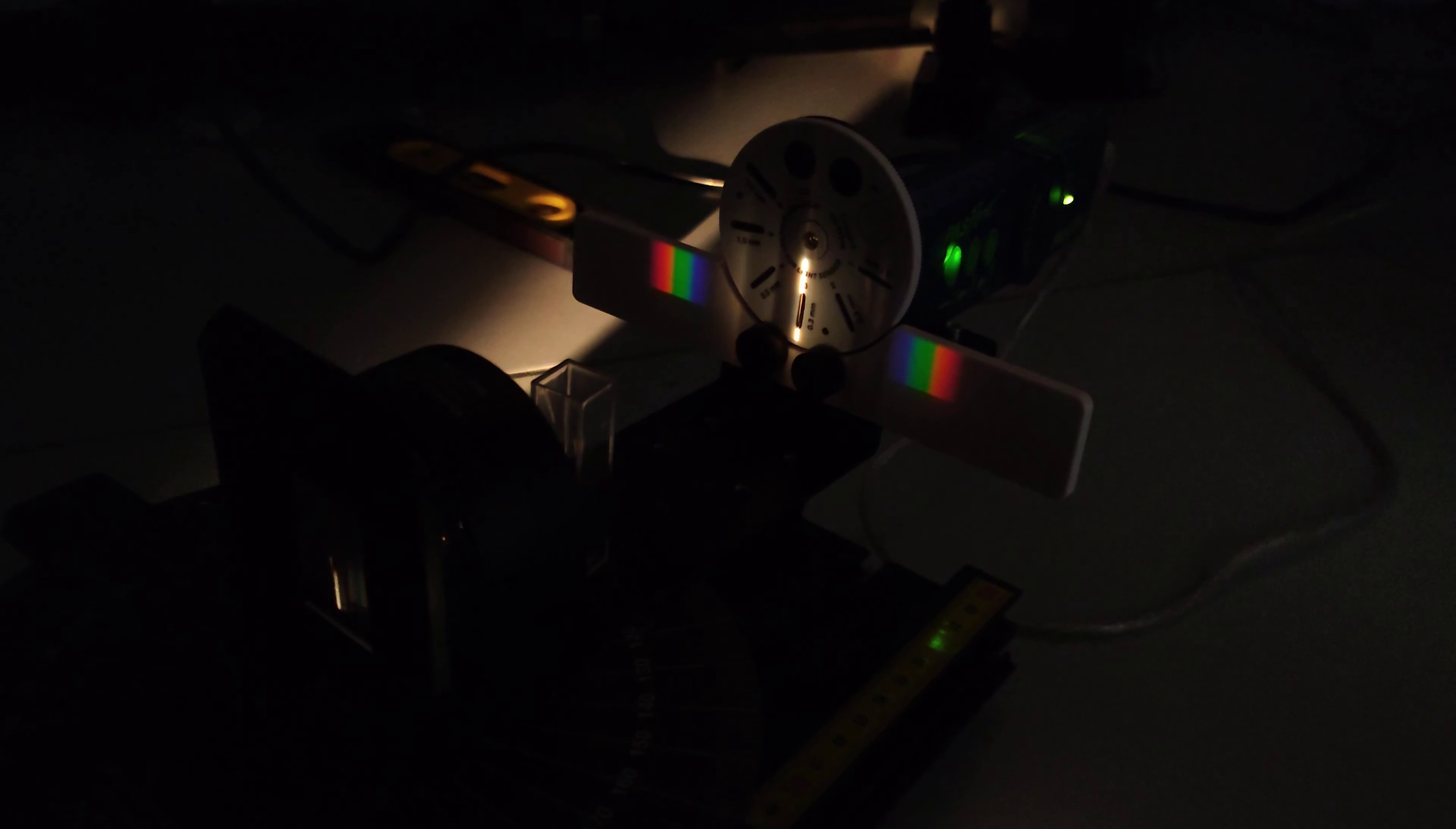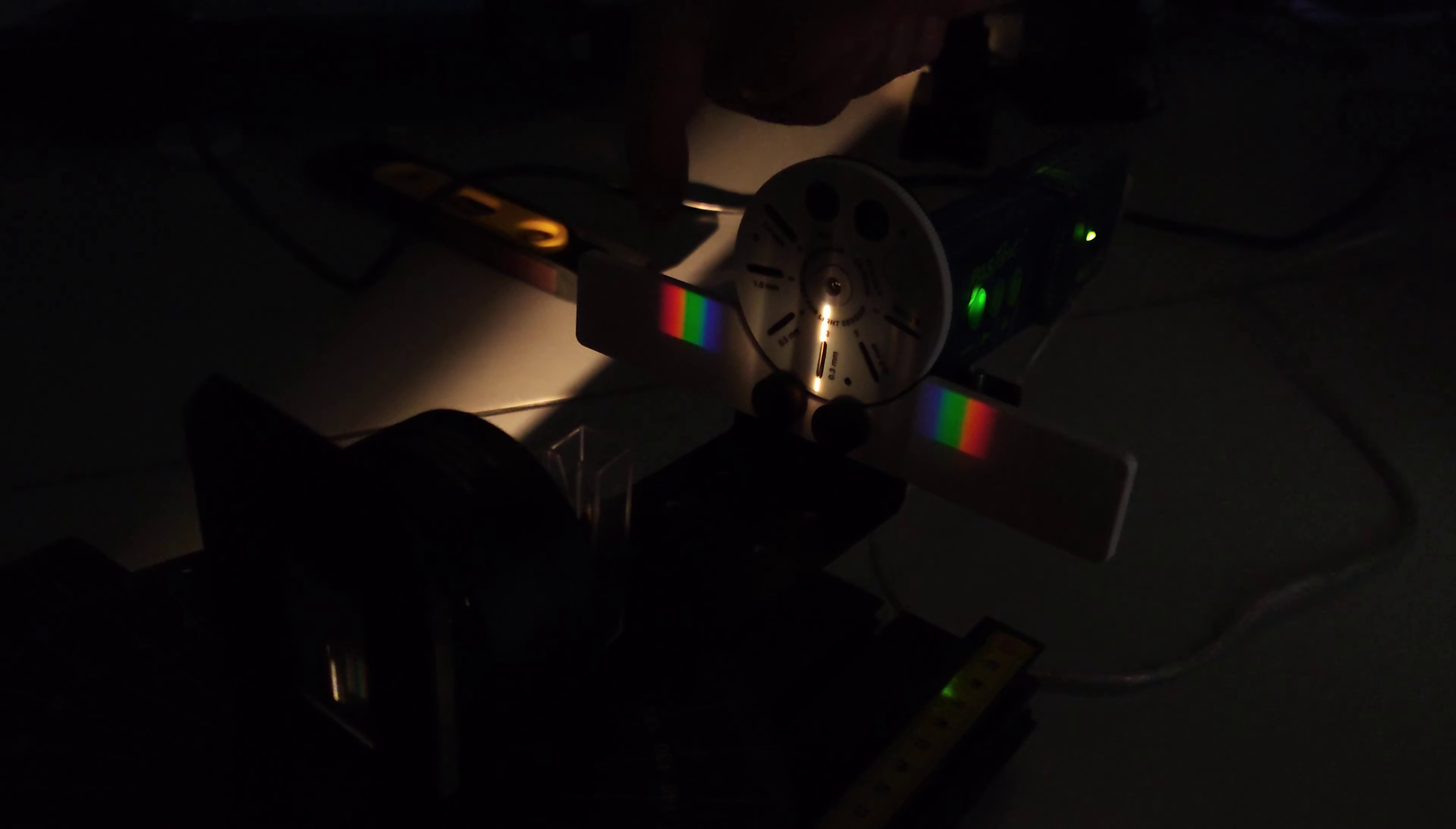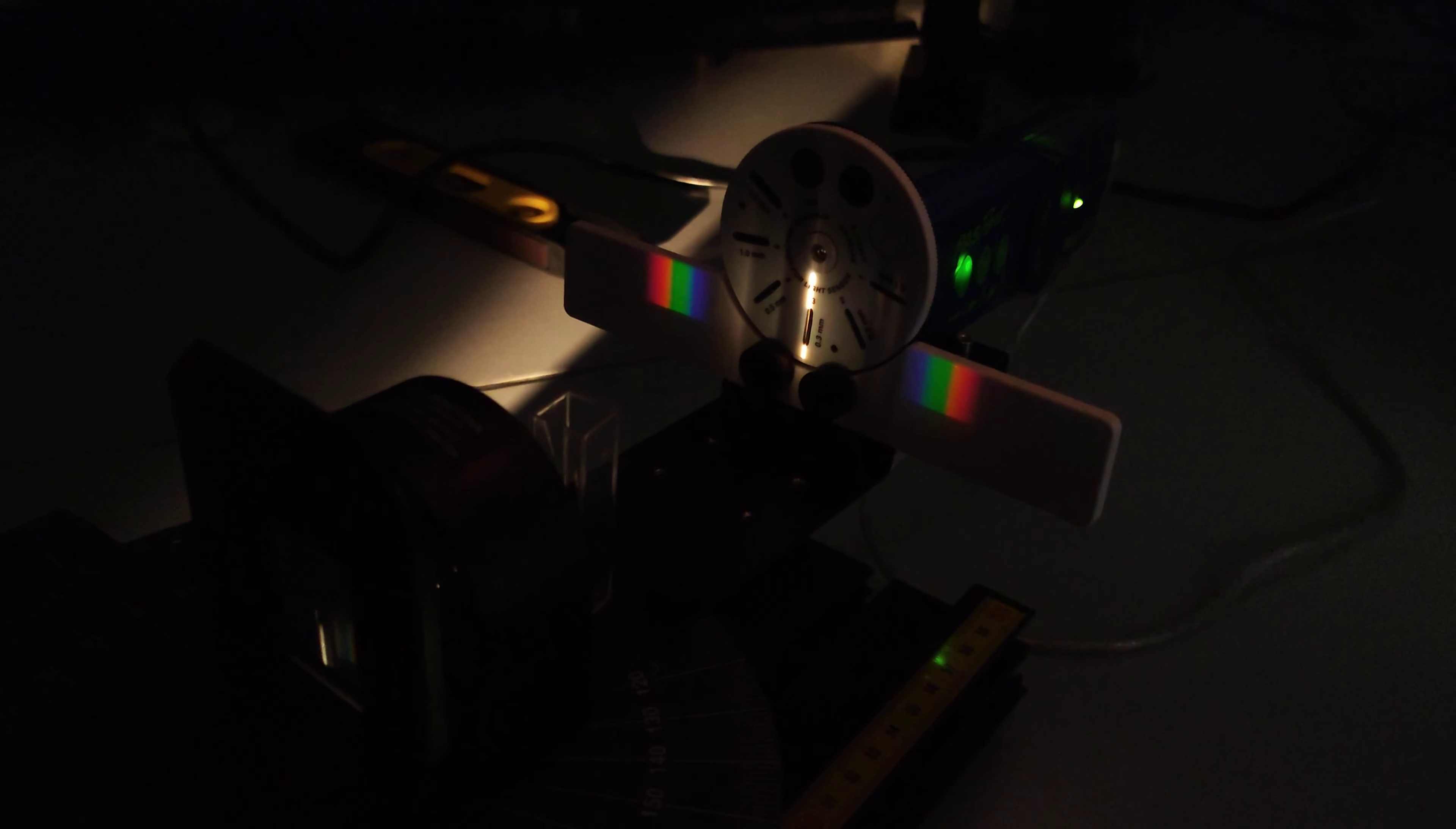Okay, now you can see on both sides the continuous spectrum of the incandescent lamp. So when the cuvette is passing through this continuous spectrum, you cannot basically see clearly dark lines.